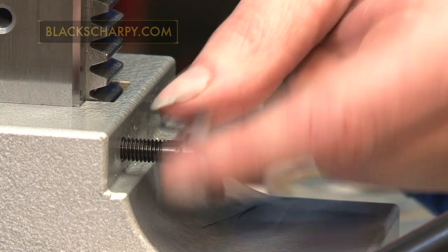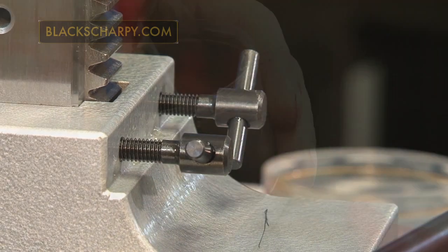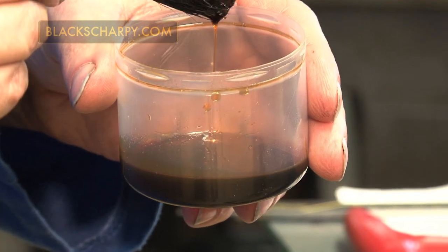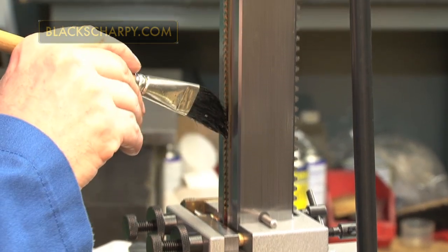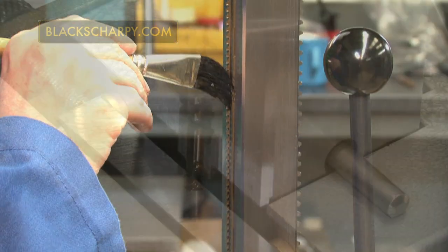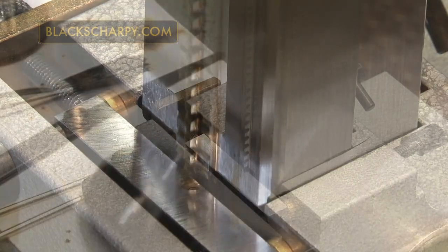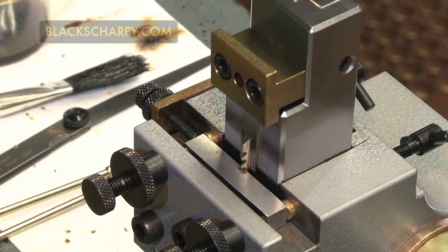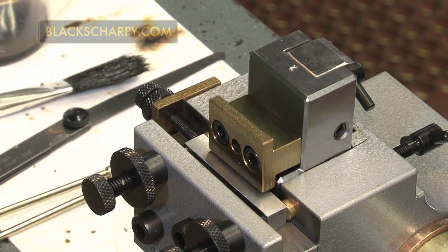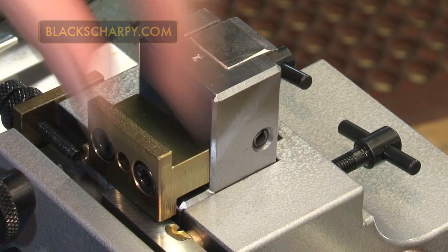Broaching the specimen. Clamp the specimen in position by tightening the rear clamping screws. Apply a coating of cutting oil to the broach teeth. Remove the support pin holding the handle. Draw the broach down and cut the notch, rotating the hand wheel at an even rate until all the broach teeth have passed the test piece. Release the rear clamp screws and remove the notched test piece.